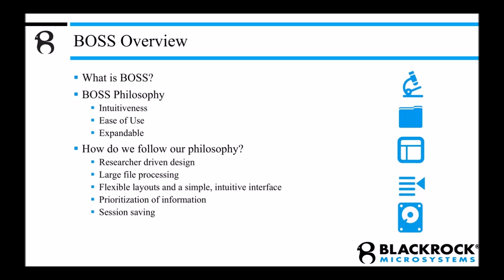Another customization we included in the software package is the flexible layout that allows you to place the windows in and around the screen in a way that helps you to be most efficient in your sorting adventures. So if you have multiple monitors, you can put different windows on different monitors or put them all right next to each other.